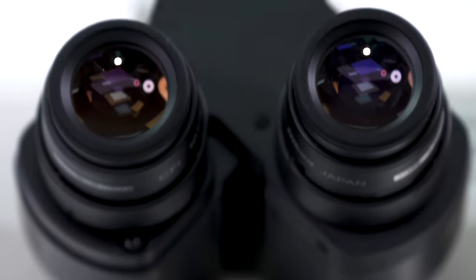Finally, the MA-Series of the MA-100N and MA-200 are the metallurgical inverted microscopes for solid materials, where a polished face is placed down on the microscope stage over the objective, so no sample levelling is required at all.